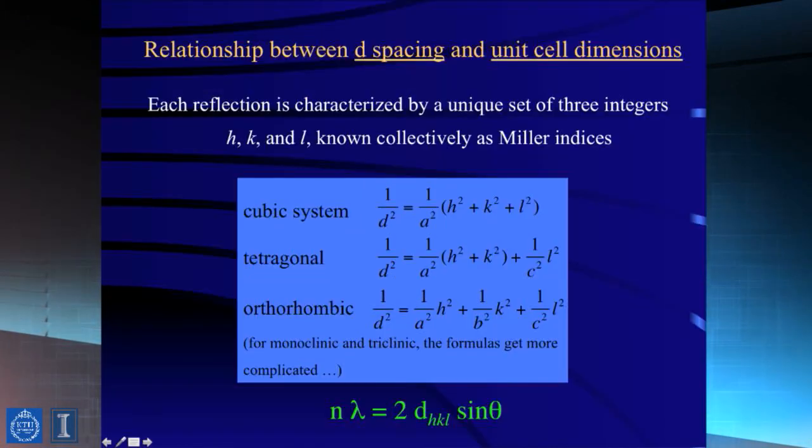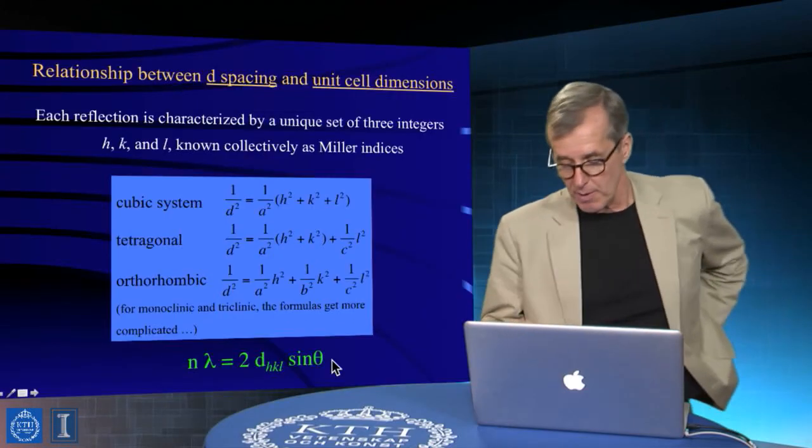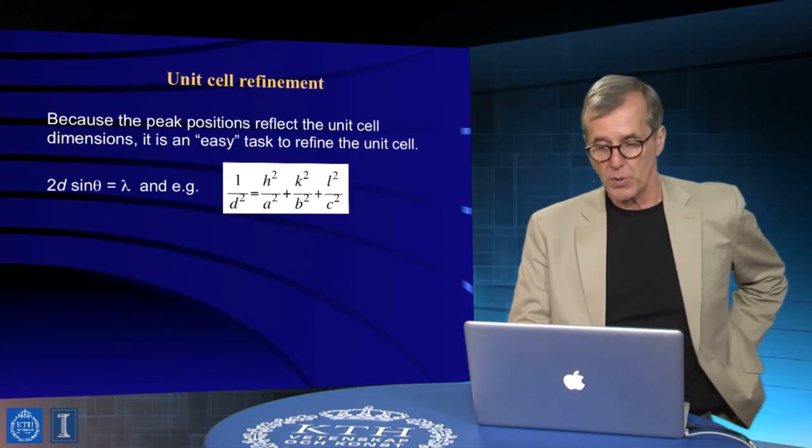For example, the description of the unique set of integers, which would actually characterize particular directions and symmetries within the crystal system. And here indicated for cubic, tetragonal, and orthorhombic components. So we can in fact get information about these kinds of symmetry attributes from the things that we would measure in an X-ray diffraction experiment. So that's kind of the simple story of it.